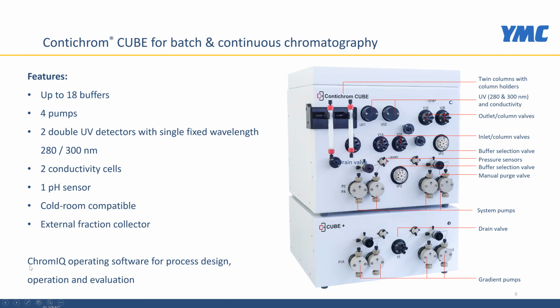The ChromIQ is the operating software for designing and operation and evaluating processes on the Contichrom system. The Contichrom system is scalable to large scale and GMP scale, and we have done this a couple of times together with YMC Process Technologies in Devens in Massachusetts.